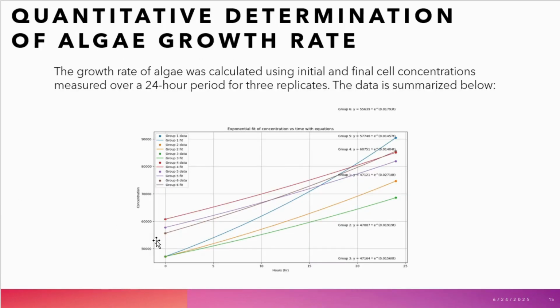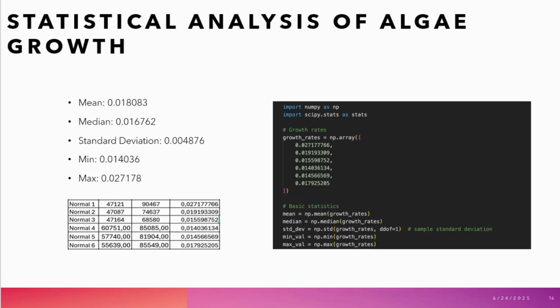Here you can see the graph of the algae growth rate using the initial and final cell concentrations measured over a 24-hour period and replicated 3 times. Furthermore, we also conducted statistical analysis of algae growth rate.